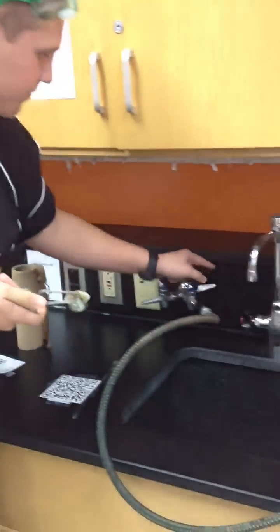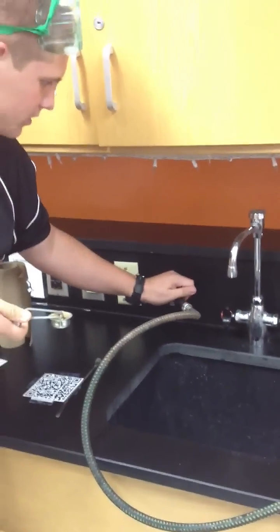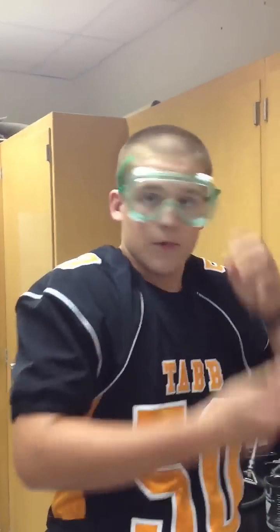First I'm going to turn on the gas. Now it's pointed toward the wall right now. The gas is off. I'm going to turn this on.